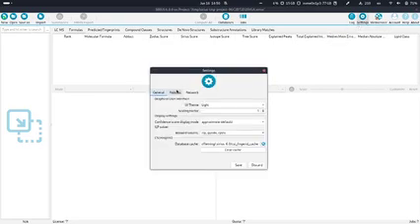There are, of course, the settings. I don't think we have to explain much here. I think this is also new in SIRIUS 6. There's now a dark theme, if someone prefers that.